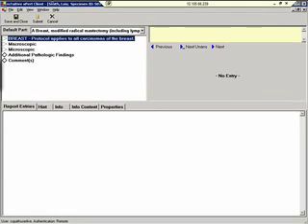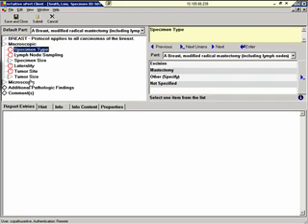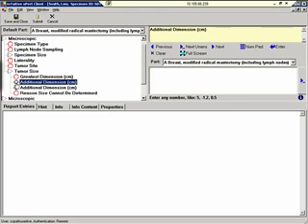Before we get started, let's take a moment to familiarize ourselves with the mTuitive user interface. In the upper left-hand corner of the screen, we have a navigation tree. Now, this is a visual representation of the CAP checklist. Required fields are designated with a red circle, while fields that are not required are designated with a black diamond. The upper right-hand pane is used for data entry. This is where the end user will be answering questions and making inputs. The buttons here are also used for navigation.